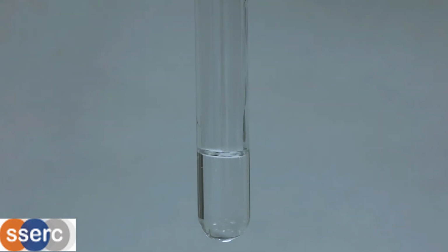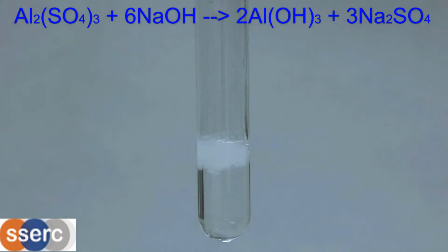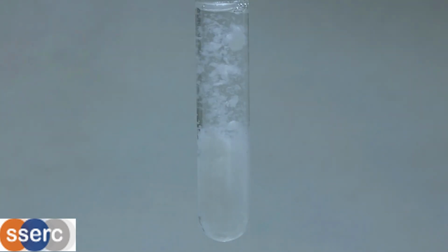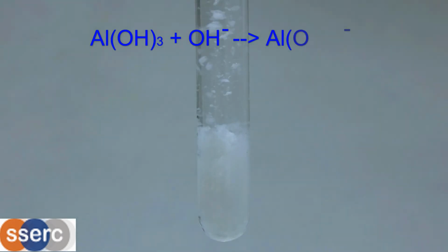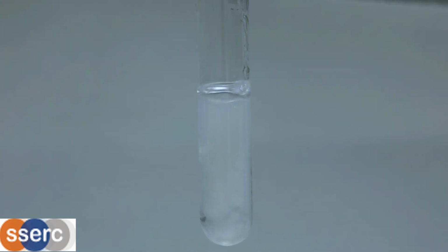Aluminium compounds, like many others, give a white precipitate. On adding excess, with a little bit of stirring, you can see that this time it dissolves. Aluminium hydroxide is amphoteric, and in this case it reacts with sodium hydroxide to form soluble sodium aluminate. In ammonia, you still get the precipitate of aluminium hydroxide, but ammonia is not as strong a base, and this time it does not dissolve.